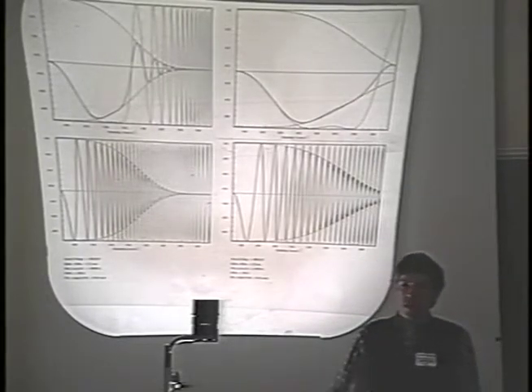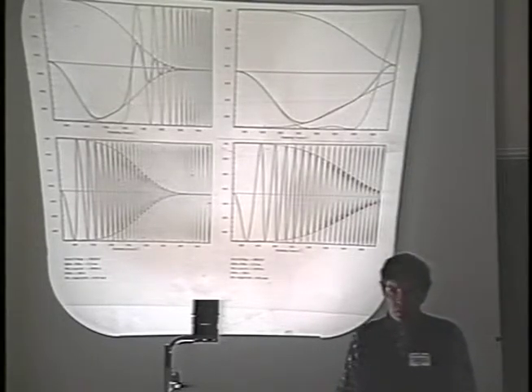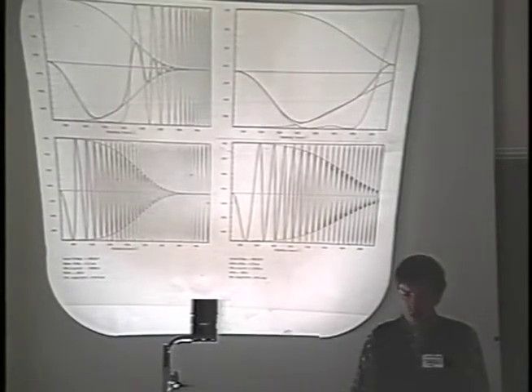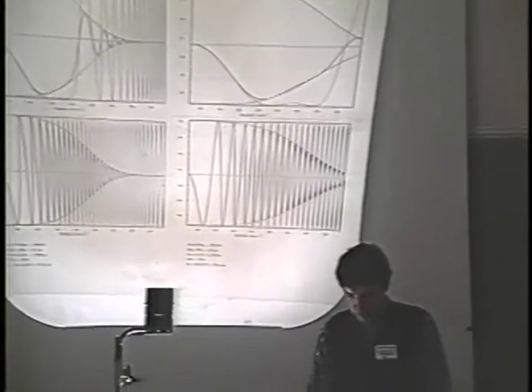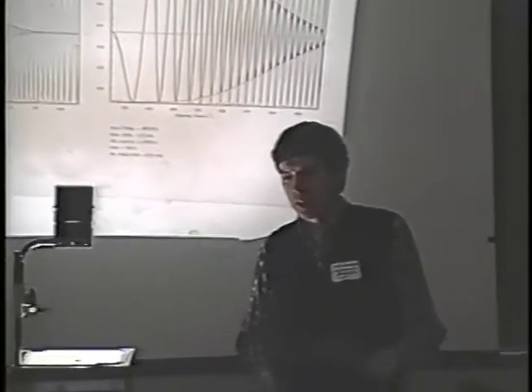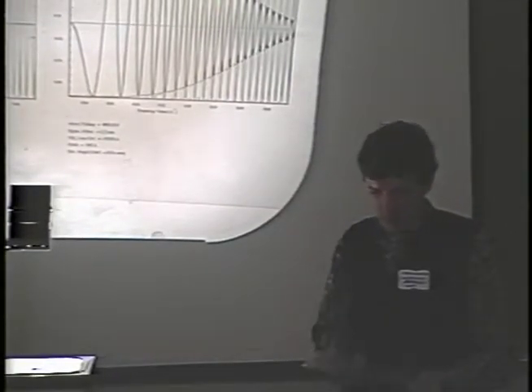But that's not so bad at high voltage. I mean, that happens with either a 100 kV or a 400 kV cold stage, but we can tolerate almost 4 times as much motion with the high voltage microscope. And that's very fortunate, because the problem with the vibration is one that is not obvious how we're going to solve in the real near future.